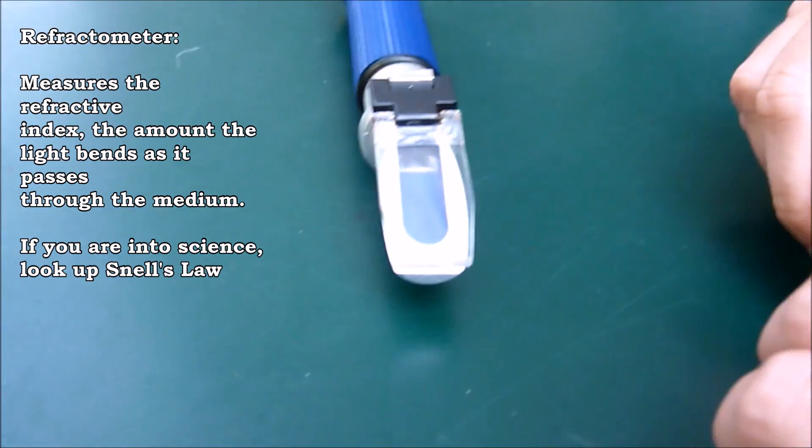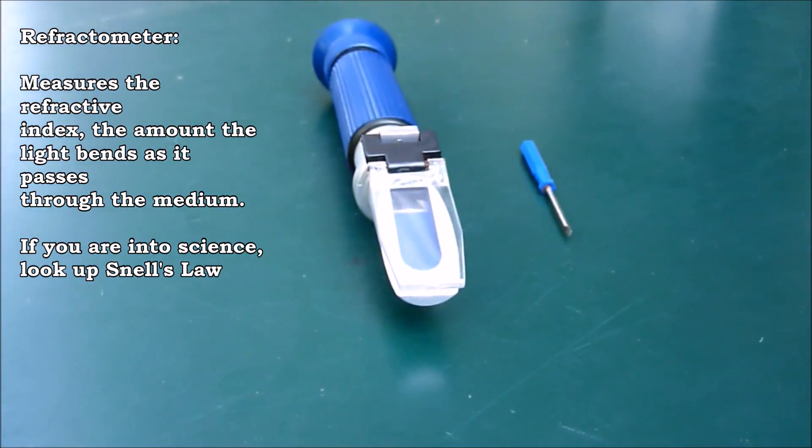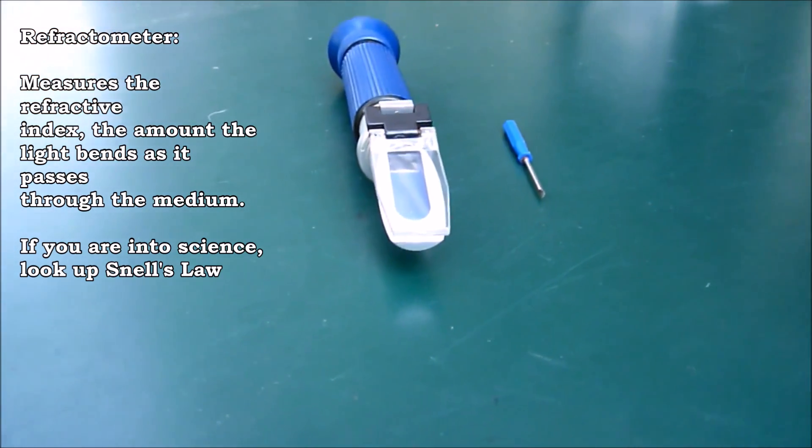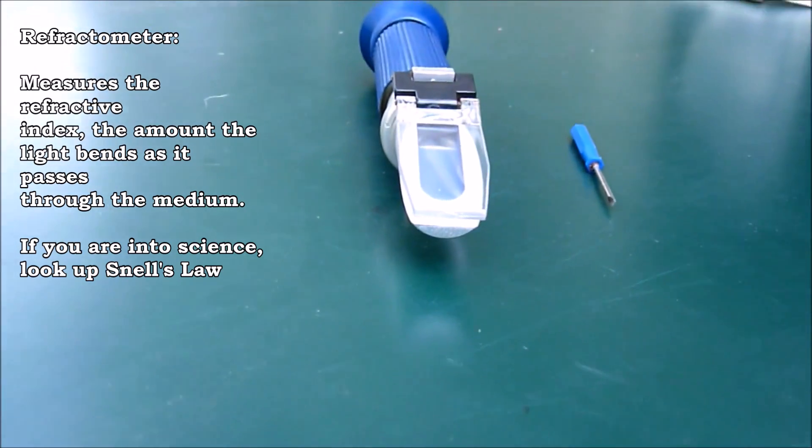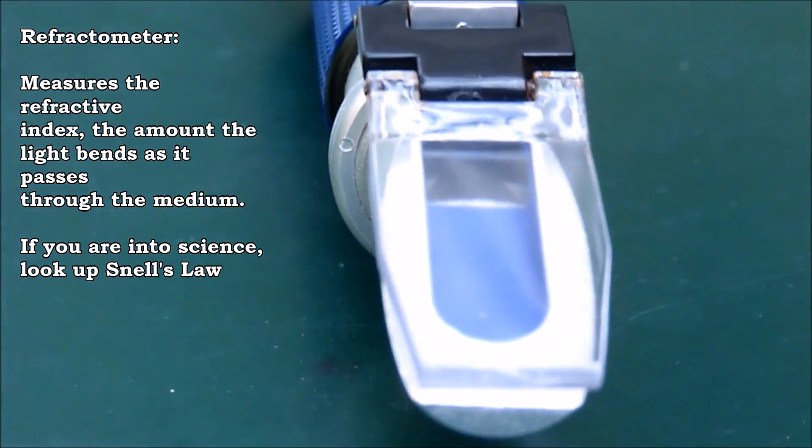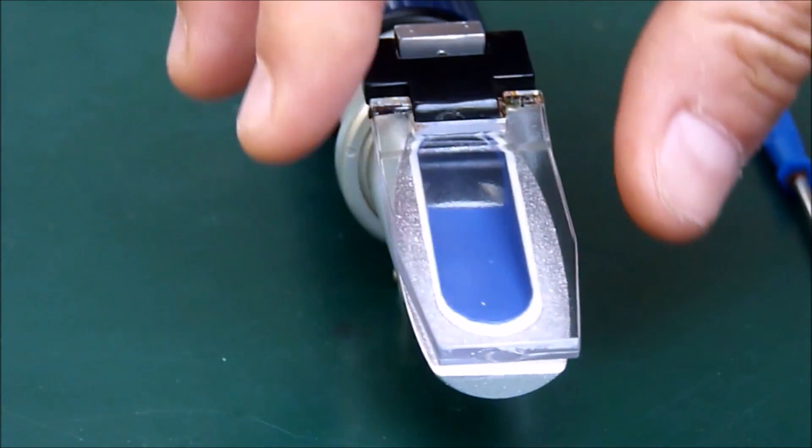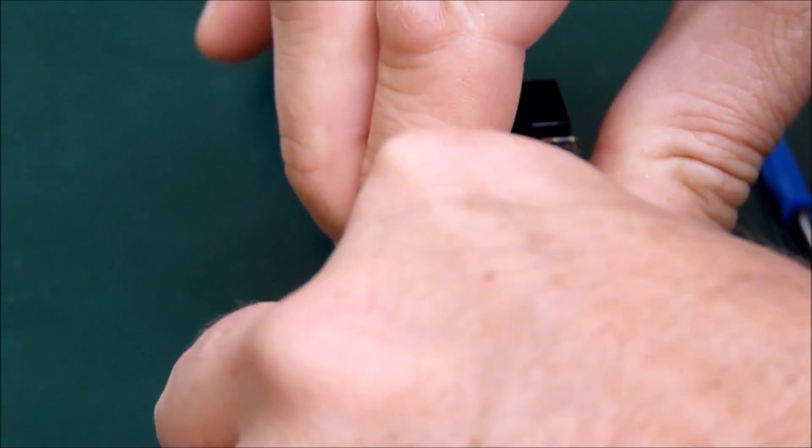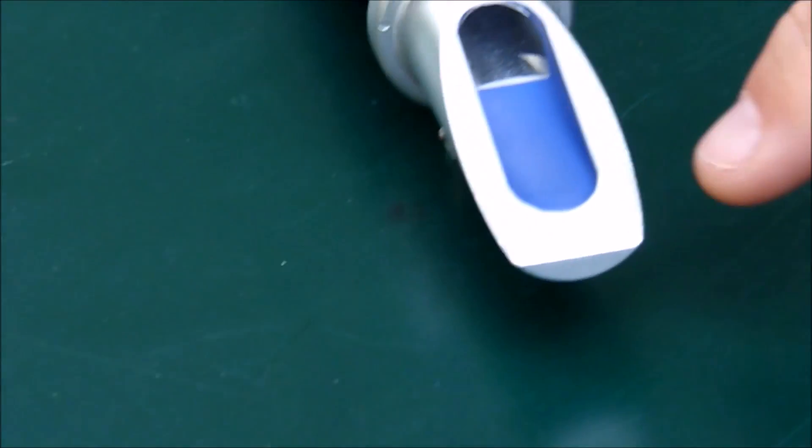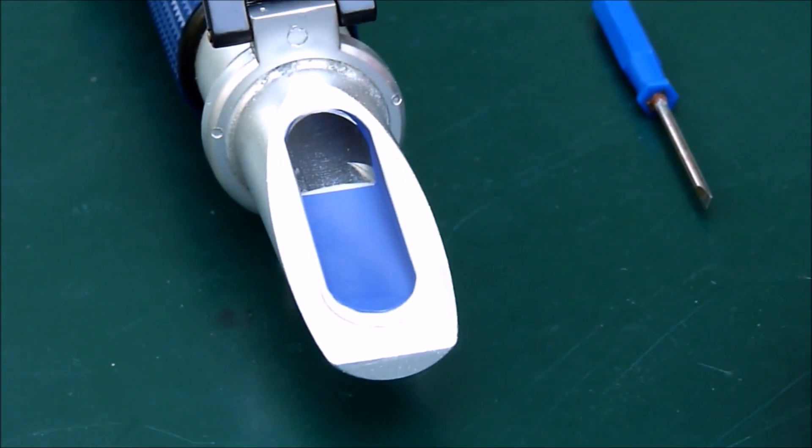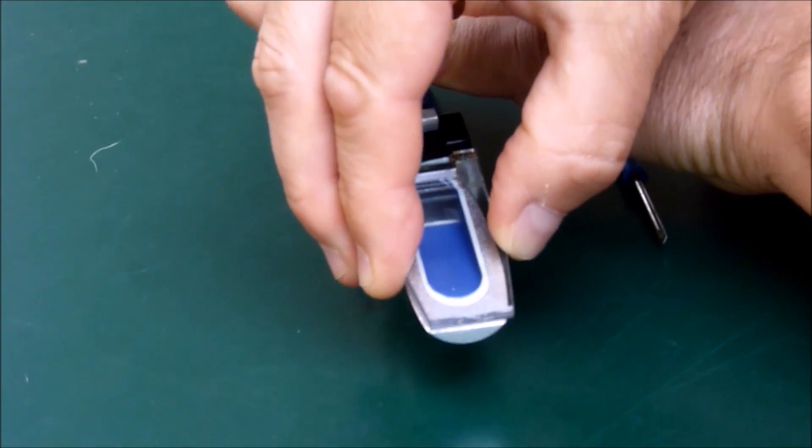So, what do we have for other options for measuring specific gravity in an aquarium? Well, what we have here is a refractometer. And, a refractometer is a much more accurate tool than the plastic hydrometer we've just shown. So, what do you do with this? You open this up. Just open this quickly. And, you put your drops of the aquarium water here. And, then you close this on it.